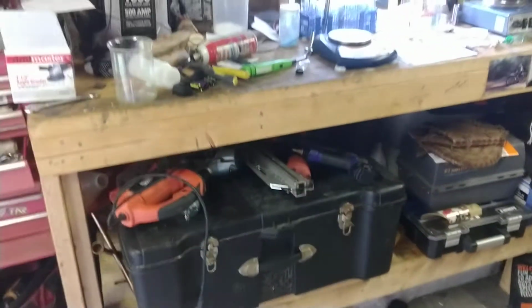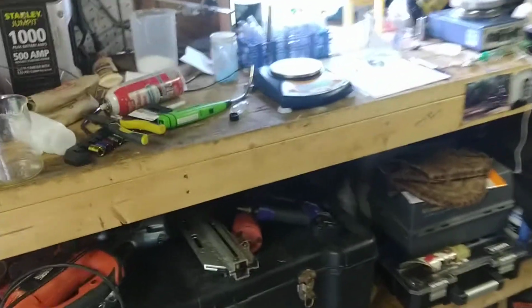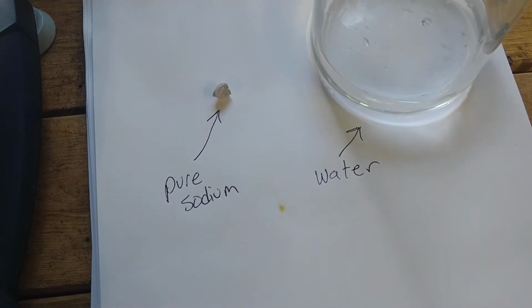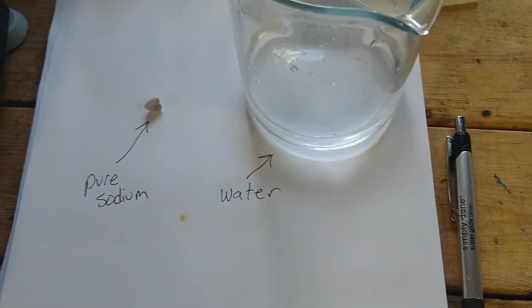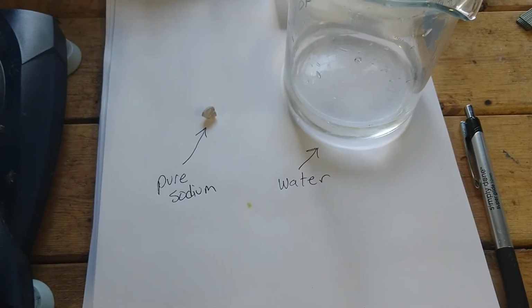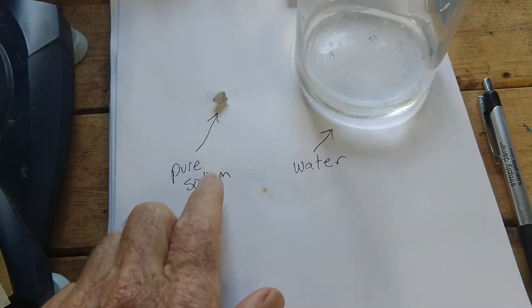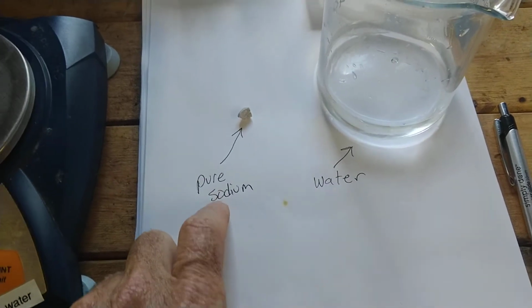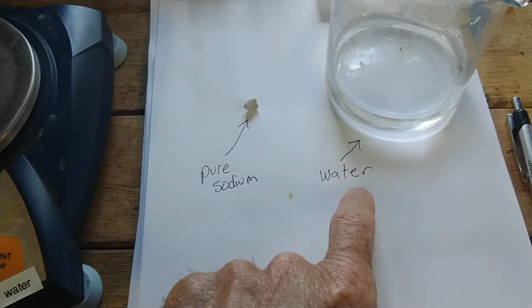Here we are for round 2 of stoichiometry, and we are going to do something pretty cool. I think you'll like it. Here I have some pure sodium, and I'm going to put it in water. And you probably already know that we're going to have a pretty cool reaction because this pure sodium is an alkali metal, and alkali metals react very strongly with water, right?